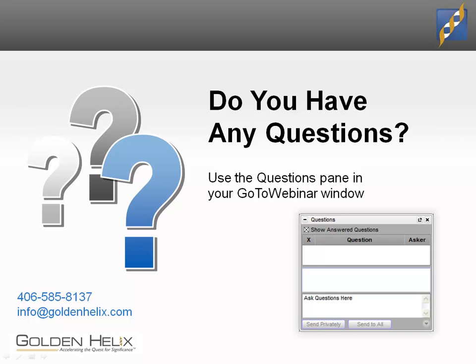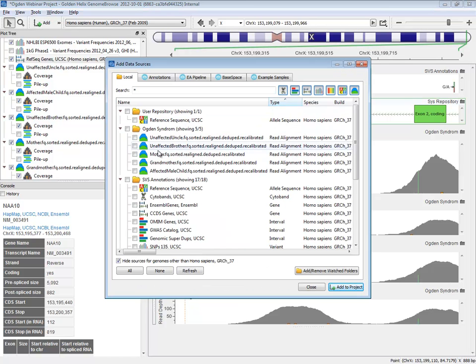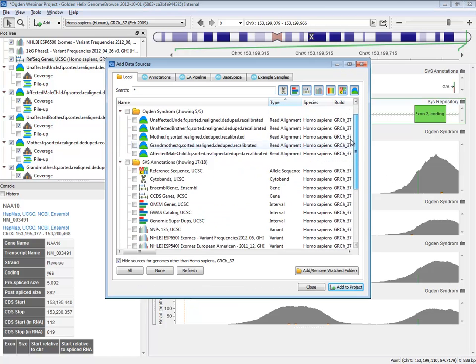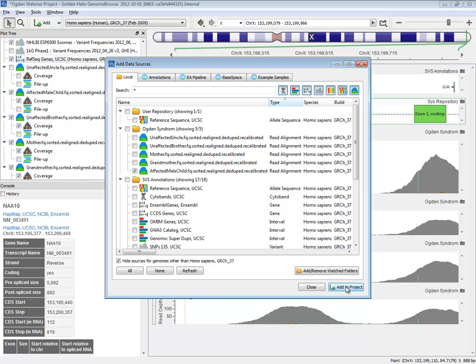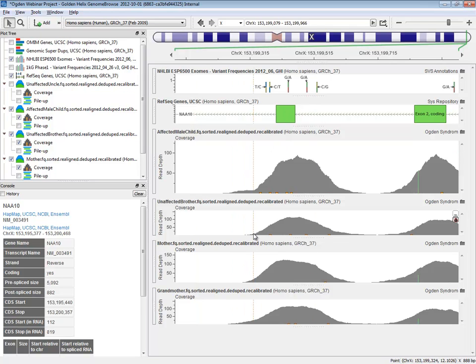Next question, can we upload a BAM file here? I think that refers to GenomeBrowse, and as I said, I didn't have time to build up this project from scratch, but from our add dialog, it's very easy to add in your own BAM files. You just throw them in there as long as you have the required supplementary files. If you don't have them, we will compute them on the fly. It's a very easy to use tool, and it should do everything for you in terms of getting your BAM files ready to be visualized.